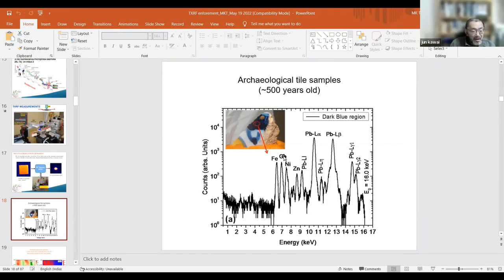Maybe if you find the reason, please inform me. I understood. Yeah, because this is log scale. There may be some peak there, because this iron, cobalt, nickel is there, lead is there. So this cobalt, iron, if you consider about 6 keV, how much is it? Maybe this problem is very difficult, and it is quantitative analysis.